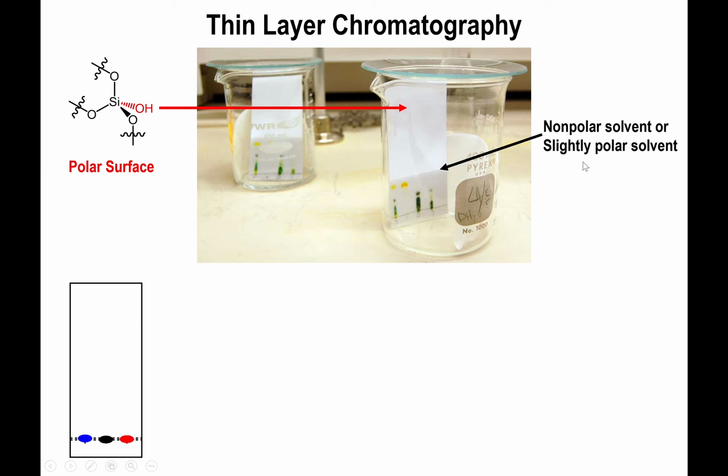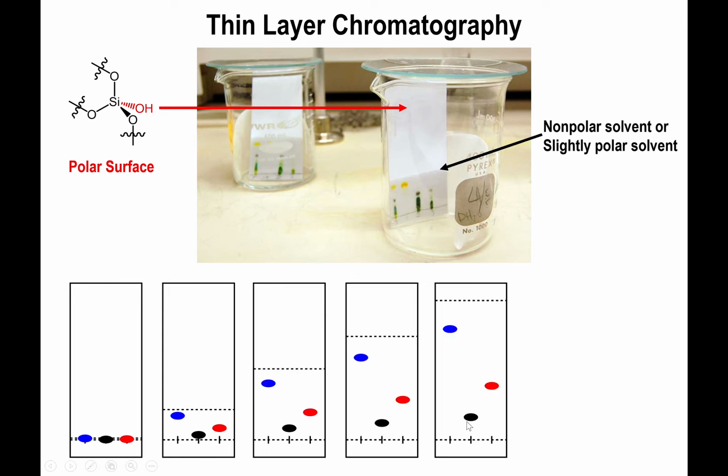And what that basically means is that when you start with a mixture and you have the solvent traveling up the plate, you start separating some of these components. And ultimately, if you do this long enough, you can have a very clear separation. You can see different spots at different distances, counting from the bottom of the plate where the marks were originally placed. And simply put, your solvent being nonpolar, if the spot is closest to the solvent end, then you basically have a nonpolar solute present in this mixture.